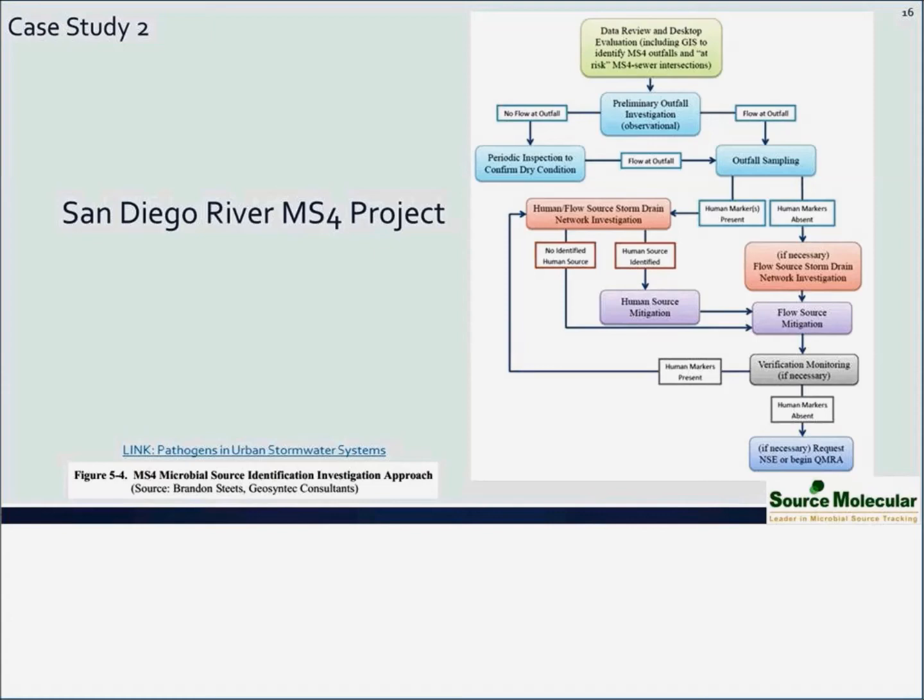So that gives you an idea where researchers are today on that form of source tracking. I think you really moved and invested into qPCR. Antibiotic resistance is like generation 1 of source tracking. qPCR is, let's say, generation 2. Digital PCR is 2.5, and generation 3 is going to be next generation sequencing, community analysis, 10 million data point computer interpretation things that are going to eventually replace qPCR, but that's still pretty far out there.